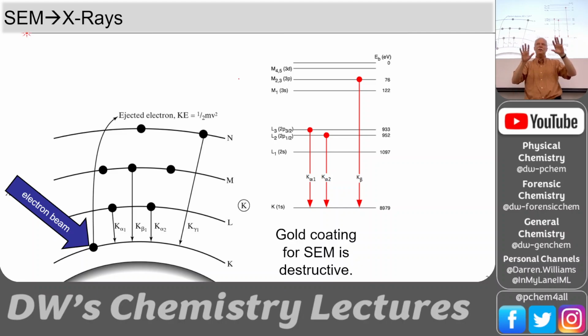And our image looks like we're looking at a swimming pool. You go to a swimming pool, it's beautiful. Before anybody jumps in, you see the lane lines, they're perfect. That's an uncharged surface. When you get in the pool, now with the ripples in the water, you look at the lines and they're all wavy. That's what your image does when your sample charges up. So you're trying to get an SEM image, trying to measure the dimensions of something, get a good clean image, and everything is just this way. And it's because the surface is charging.